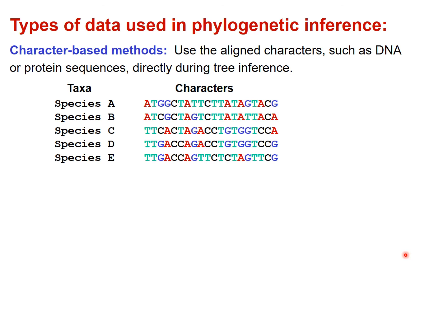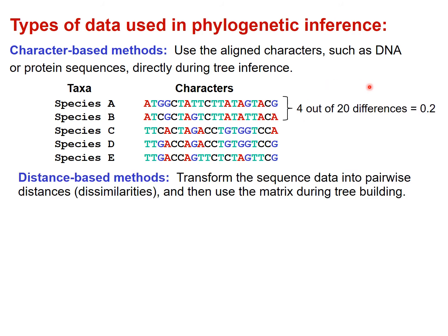You can also do this with protein sequence, and we're going to infer the tree branching order from these sequences. So here we have our species A through E. And here's a small region that has been sequenced. You can see at some positions there are differences. So there's a couple of A's in A and B, and then there's T's in the rest. And you can see here's G and then C. And along this, you'll find that there are differences.